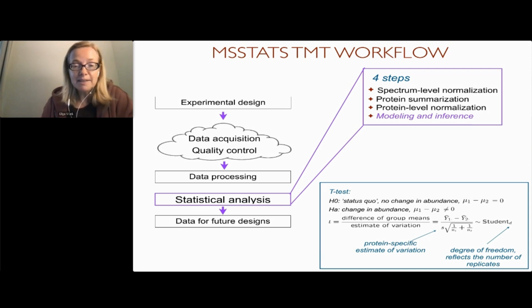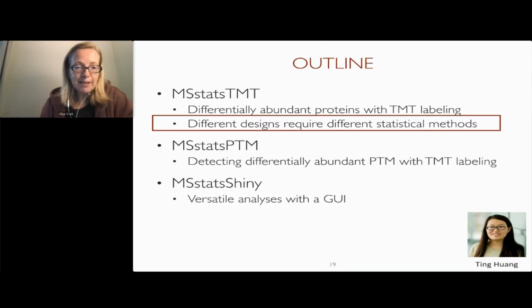And then the last part is modeling and inference. And in this case, we need to make sure that we account for the fact that we still have multiple plexes. And this is the part that I would like to now talk about. And the rest of the topics I will mention very briefly.